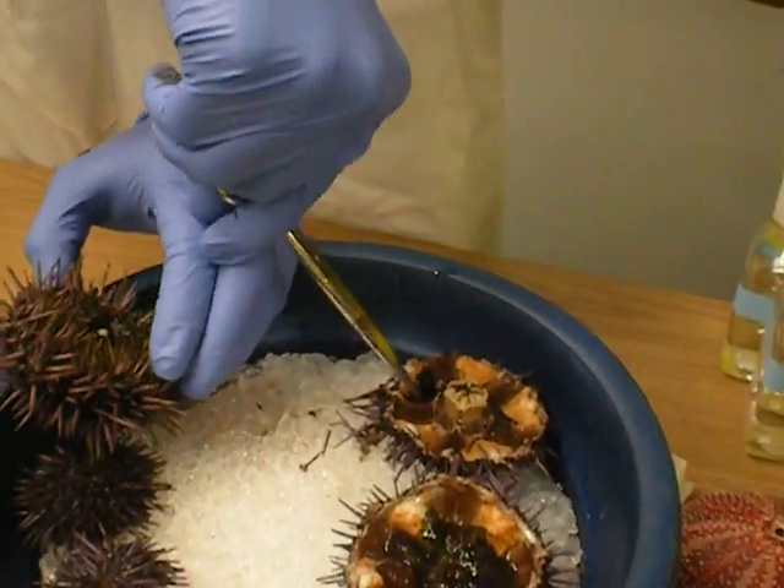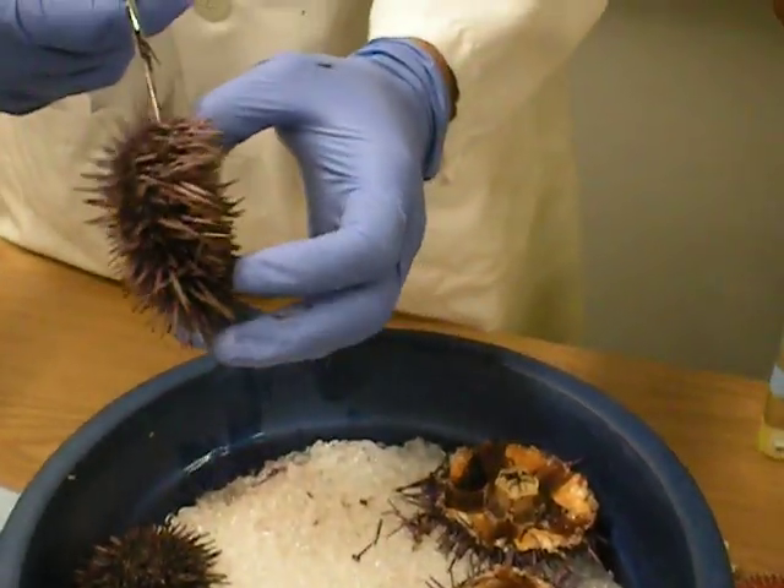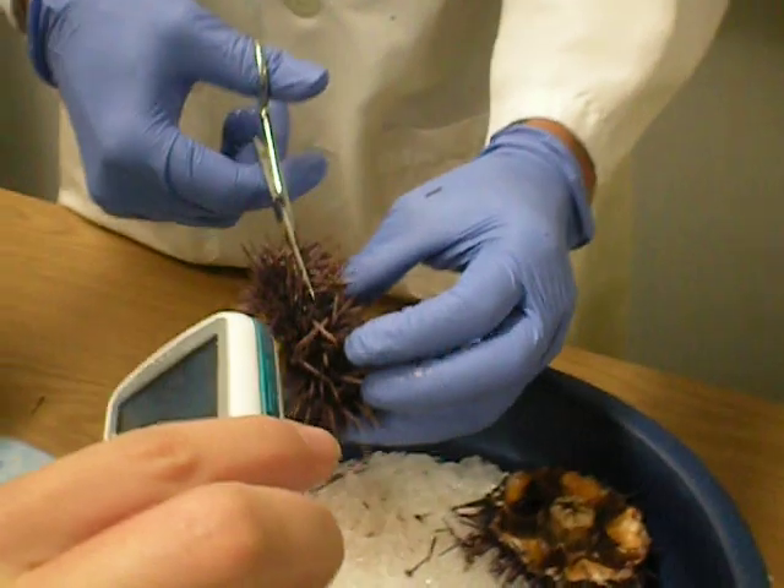I would think the meat is this part right here, the orange part, right? No, the orange part's the gonads. That's right, yeah.